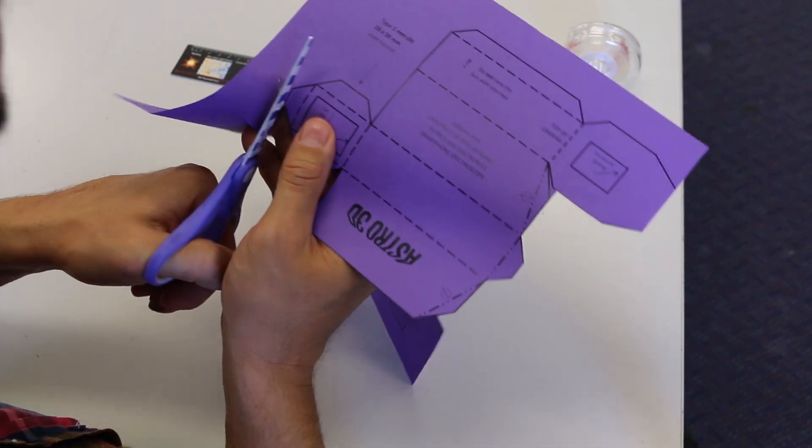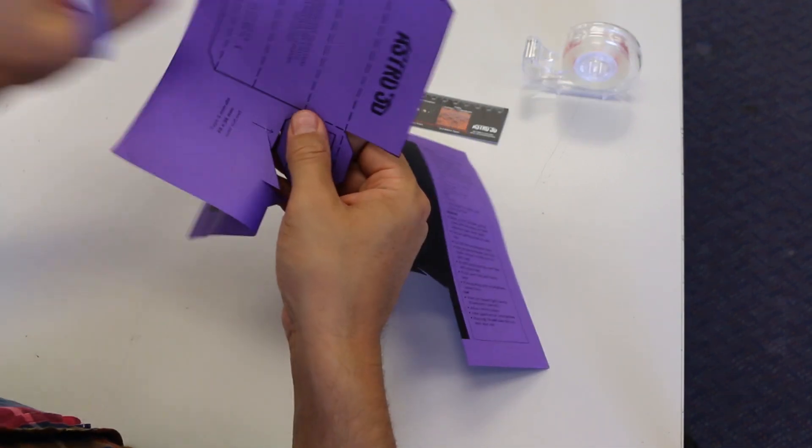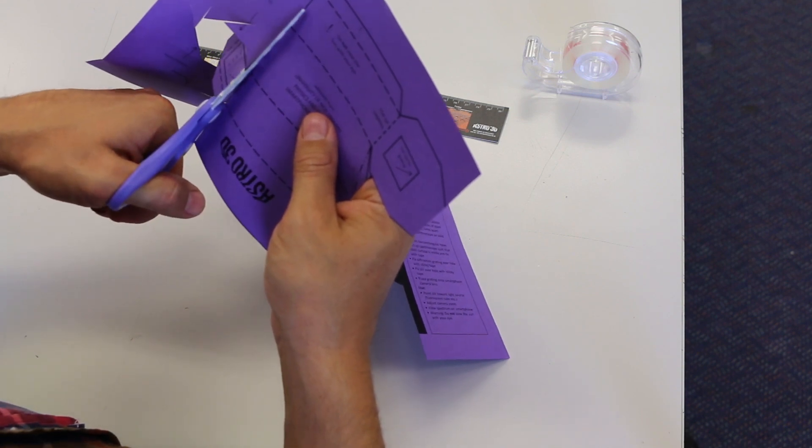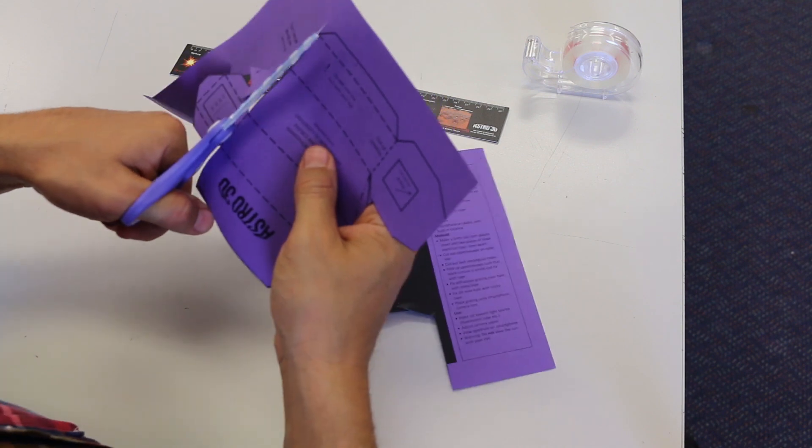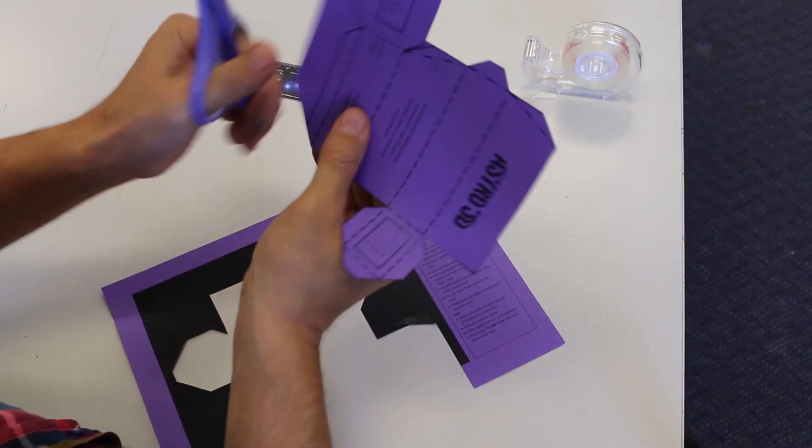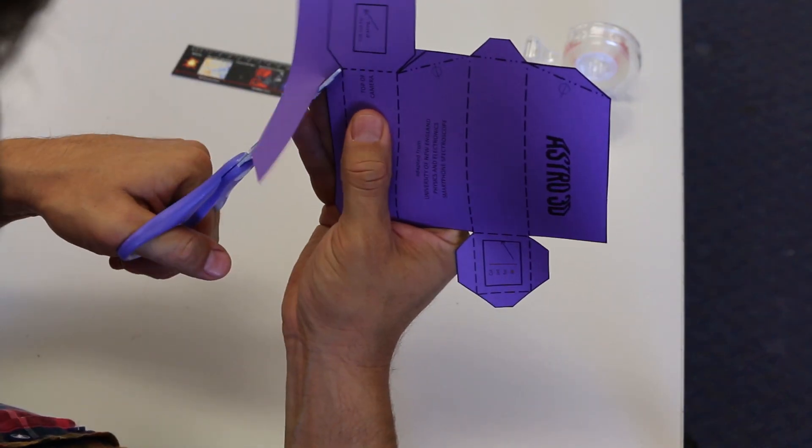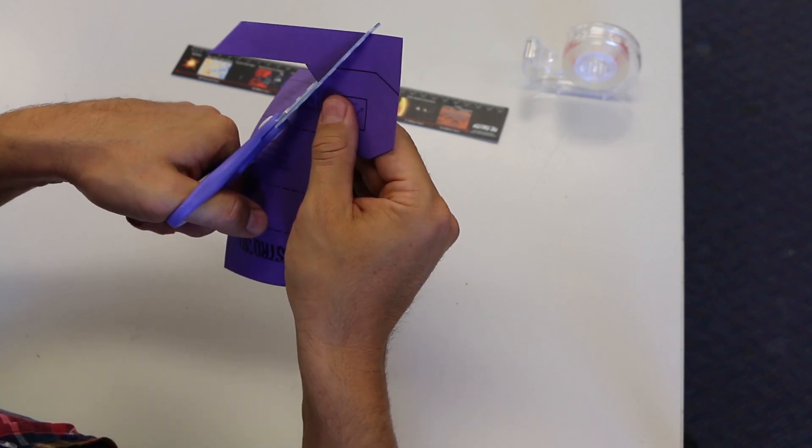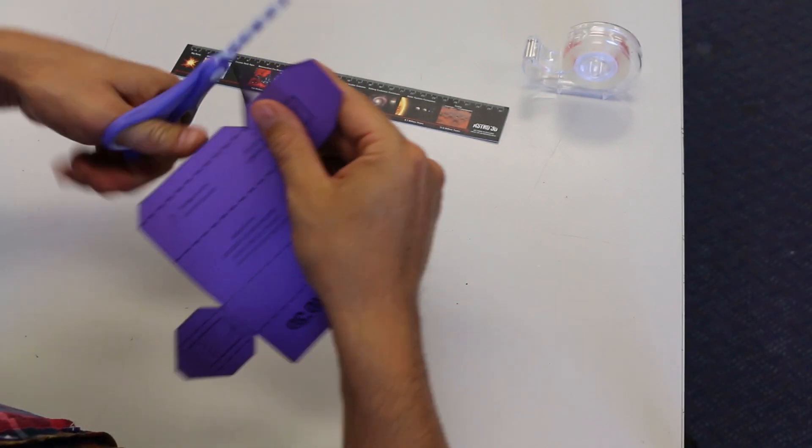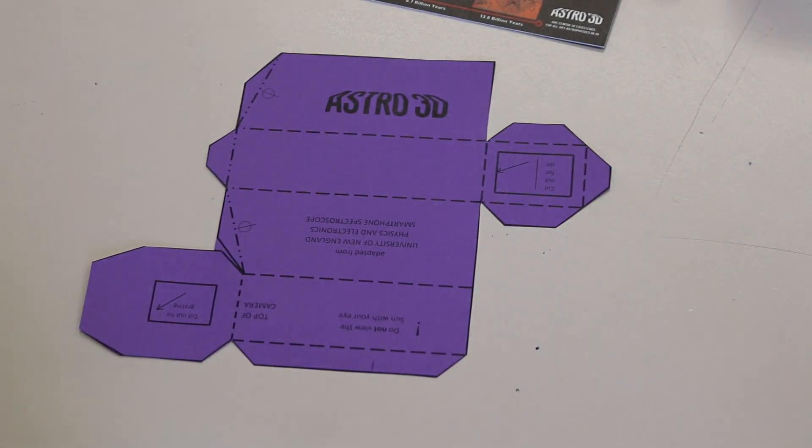You don't want to rush it but you don't need to be too meticulous with your cuts. Just once again following that black solid line around the outside. The reason why the other side of the page is black is because that forms the interior of the spectroscope, and we want that interior to be black to absorb any extraneous light that's bouncing around the inside there. So there we go, that's the spectroscope plan fully cut out there.